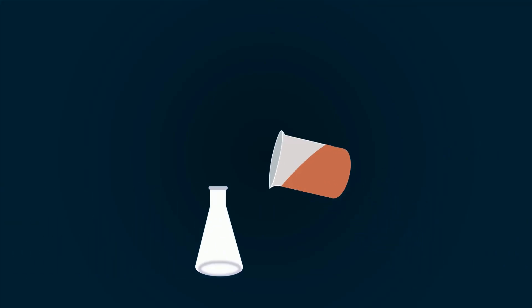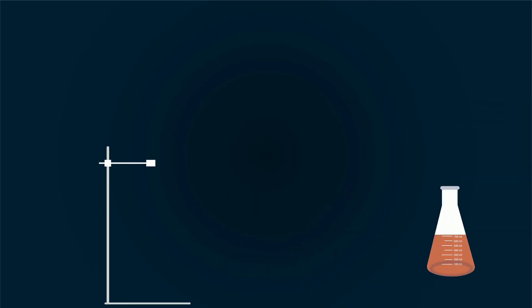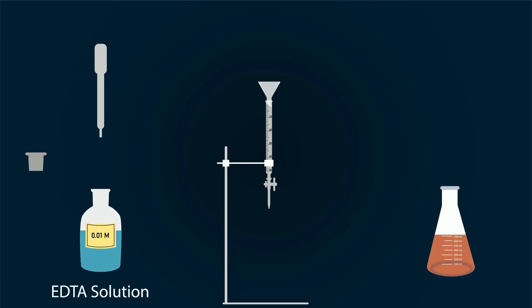Now put the solution into the conical flask. Now we have to start titration. For this, take a stand and add burette on it. Now with the help of a funnel, add 0.01 molar solution of EDTA into the burette up to the 0 point.